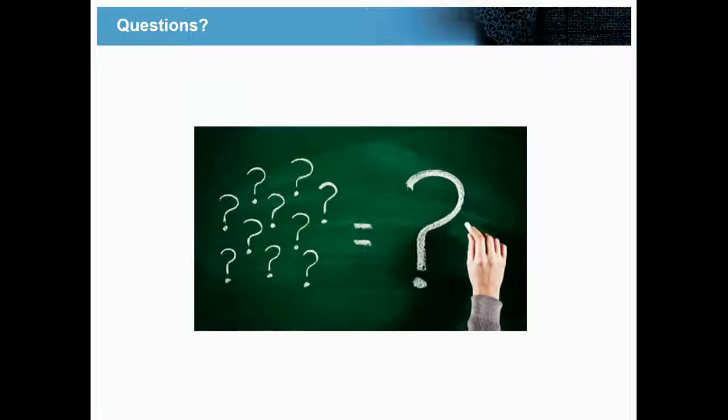Hi, my question is, can you use your workflow to create a library if, instead of standard retention time peptides, you are using endogenous ones? Yes, the short answer is yes, I think. These spiked-in peptides are really just a convenience, to make sure that you have something that's always in every sample that's the same. There was a visiting postdoc in our lab called Sarah Parker who came with a bunch of data, and she wanted to analyze the data, and she didn't have all these iRT peptides spiked in.